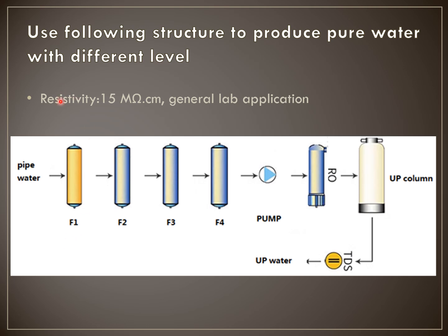required. If your required resistivity is higher than or equal to 15 megaohm centimeter, then you install 4 pre-treatment, 1 RO, and 1 ion exchange. Then the water will be qualified to reach this level.